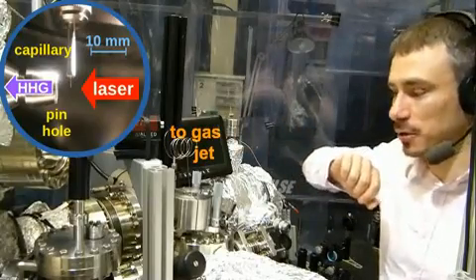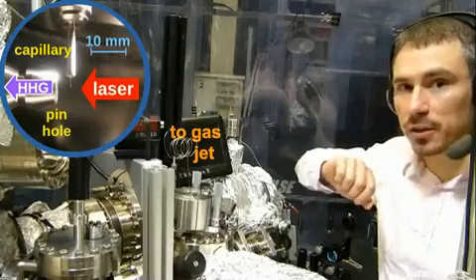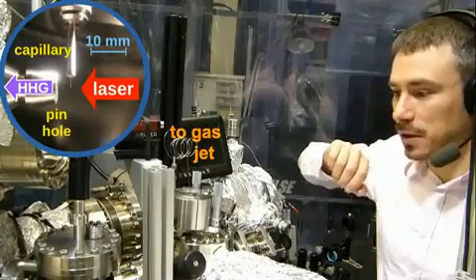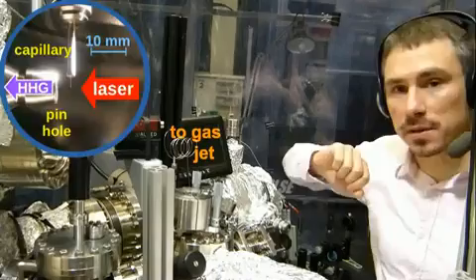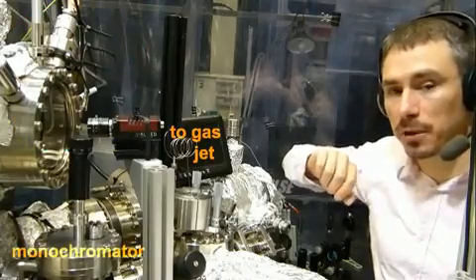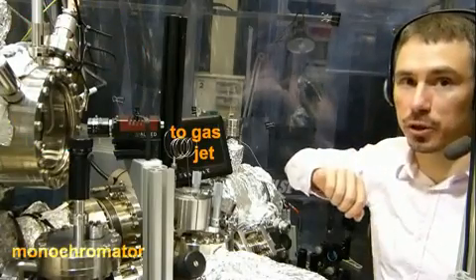There, the generation of the high order harmonic light takes place. Afterwards, there is a monochromator with a toroidal grating where we can select the energy to do photoemission.